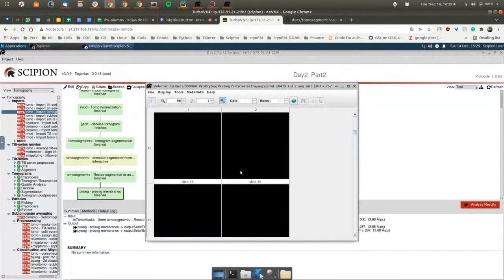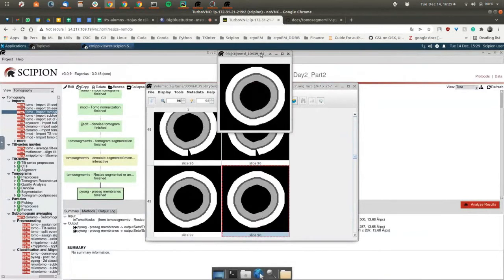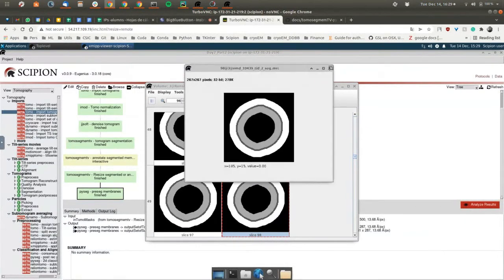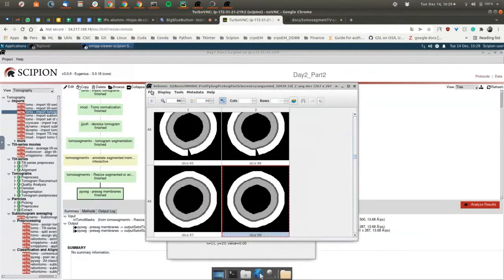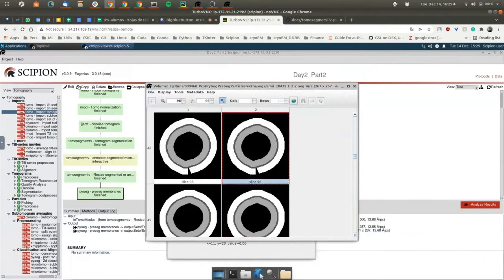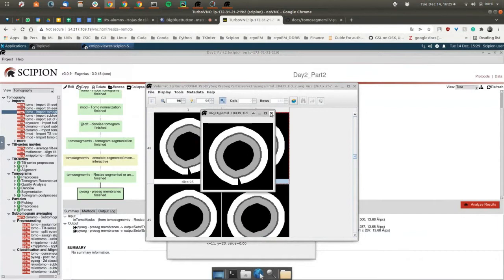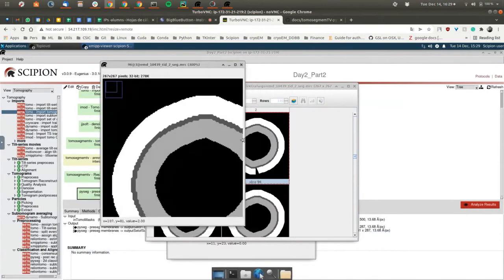to be good. From this XMIPP viewer, yep. I don't know why it's not maximizing. Normally, you can maximize with shift and doing a scroll with the wheel. Okay, nice. As you can see, this fantastic guy named José Luis Vilas is one of the developers of Xmipp.